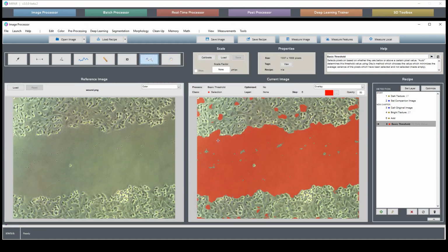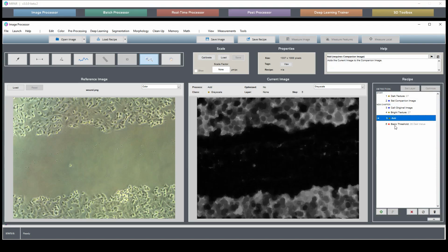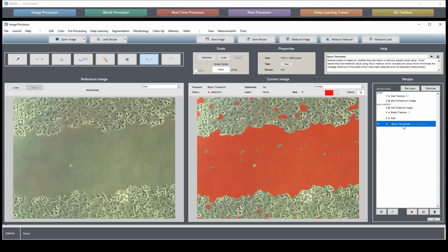And you notice that the image is also a lot cleaner when you start combining filters. A lot of random noise gets evened out. But we're kind of back where we started with the adaptive threshold. Now we have 5 steps to get to an image that can be segmented. What we'd really like is to have a filter that will find both light and dark features. We'll highlight both light and dark features. That way we don't need to worry about multiple steps and adding and stuff.